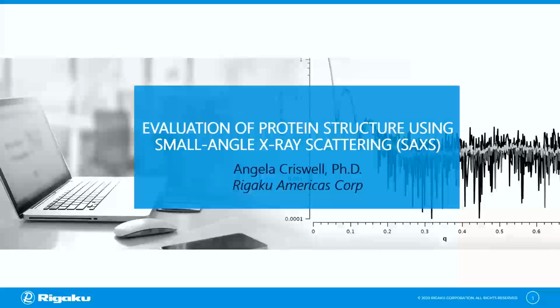We can also ask questions about the protein structure as a consequence of changing the solution conditions, or looking at it at high concentrations or low concentrations, or we might look at it in the presence of binding partners. So very useful in that sense. Additionally, this technique usually requires only a minimum of sample preparation, and also there are many computational tools to analyze SAXS data, so it can be quite powerful.